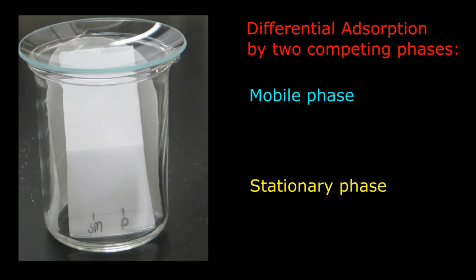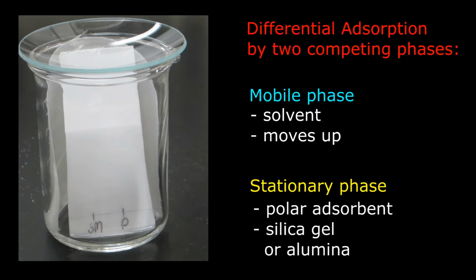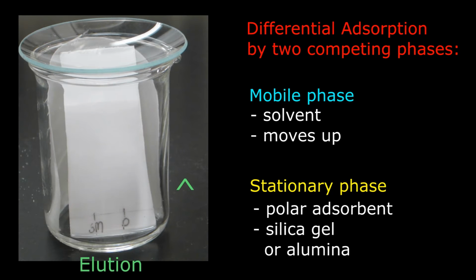The solvent is called the mobile phase because it is the component which moves up the stationary phase on the TLC plate. The stationary phase is a polar adsorbent, commonly silica gel or alumina, which are both powders that are coated onto a solid support such as glass, plastic, or aluminum plate. This process of moving compounds with a solvent is referred to as elution, and the solvents used are eluting solvents. The overall procedure is referred to as developing the TLC plate.